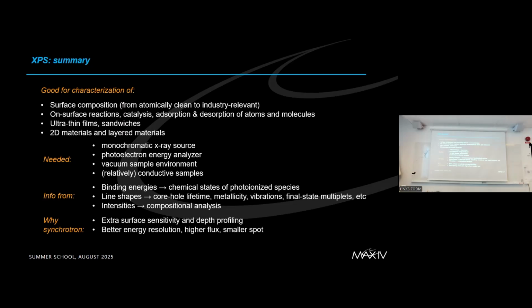And if you take the difference in energy between the first order light and the second order light, it gives you exactly the photon energy. So this is a very, very solid way of finding the exact photon energy in the system.